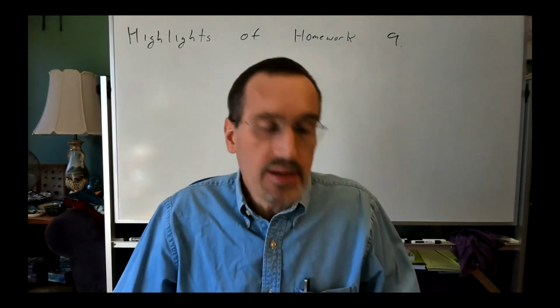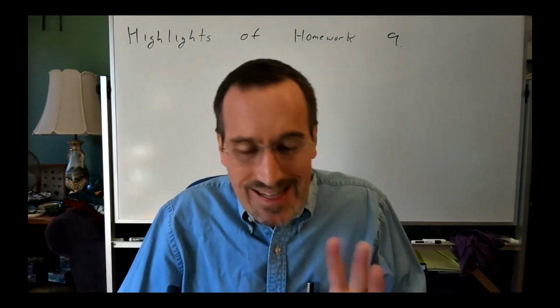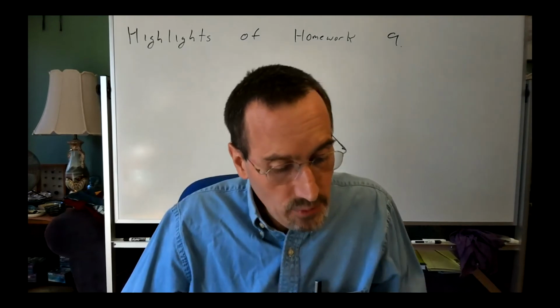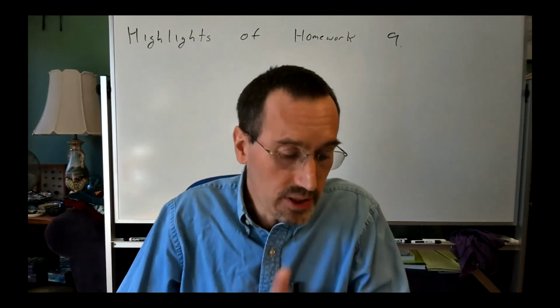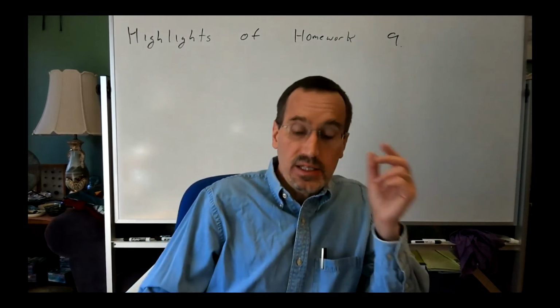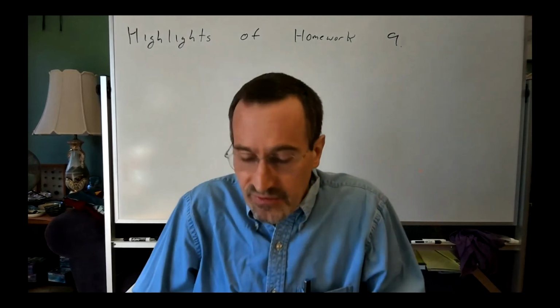All right, I want to talk about problem number 4 at this point. In about 2011, we introduced HSQC-TOCSY into the class. Remember, we talked in the last lecture about HMQC-TOCSY and HSQC-TOCSY, which are comparable techniques that differ just slightly in pulse sequence. And so I wanted to deal with a problem that had severe overlap.